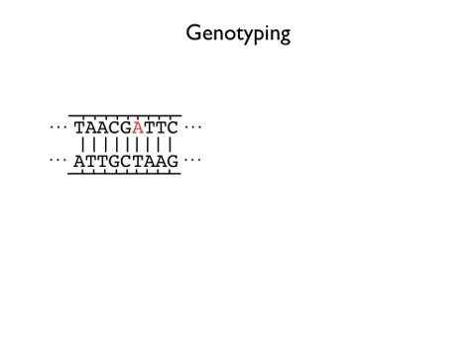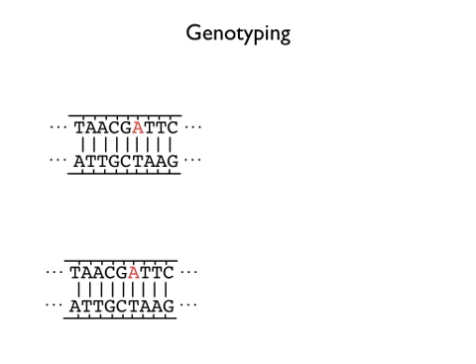But when they weren't erasing them, we got hold of them and looked at them and found some issues. And I'm going to explain them. They are informative, even if you're not going to do base calling, just to know the kinds of errors you can expect. So I'm going to use genotyping as the application of interest, right?